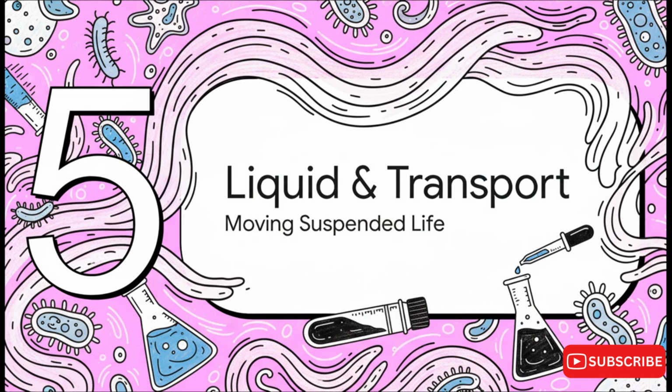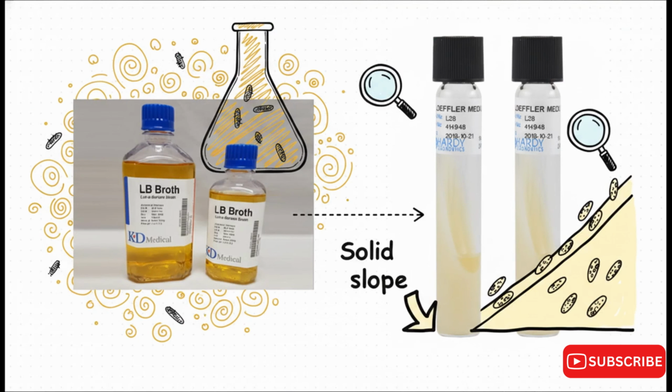Section 5, Liquid and Transport Media. Up to this point, we've pretty much only examined solid environments, but we absolutely have to understand liquid states too. Contrast these two environments. On the right, we have the solid slope of the Loeffler agar we looked at a bit earlier, but on the left, we see Luria-Bertani, or LB broth. This is your classic general-purpose liquid medium. It's a golden yellow, nutrient-rich broth used extensively in molecular biology for the routine cultivation of E. coli. It just provides this nice, free-floating liquid environment for the microbes to multiply incredibly rapidly.